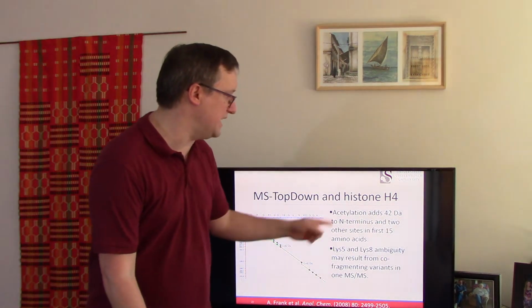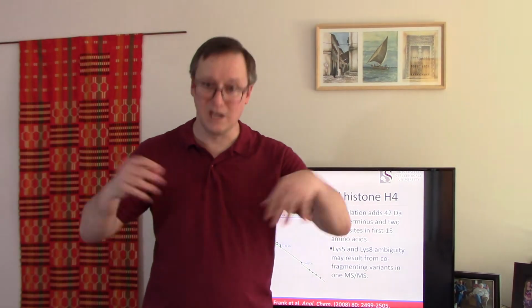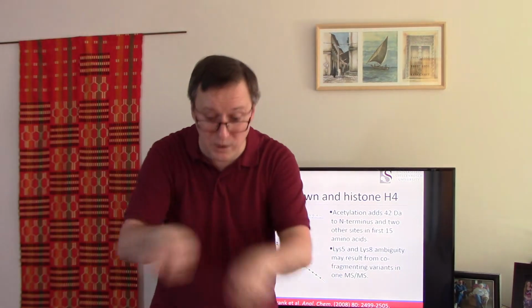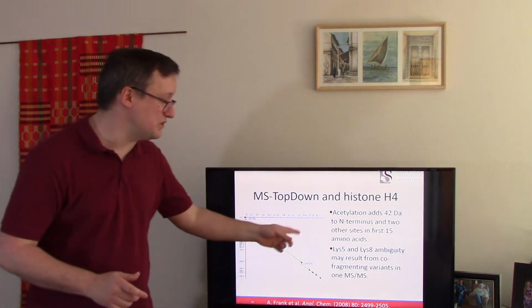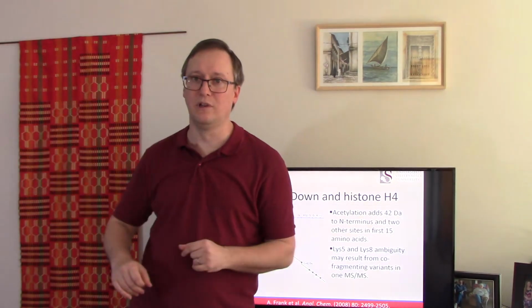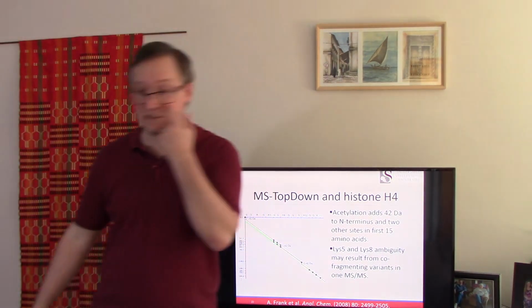Here we had 3 acetylations, so that's going to be 3 times 42. So 126 Daltons differ between the first 15 amino acids and what the spectrum has to show. The software is now trying to divvy up that 126 Daltons into recognizable PTMs along with locations on that sequence. It's pretty impressive, and this approach is highly efficient compared to the massive expansion of all possible localizations for those masses.